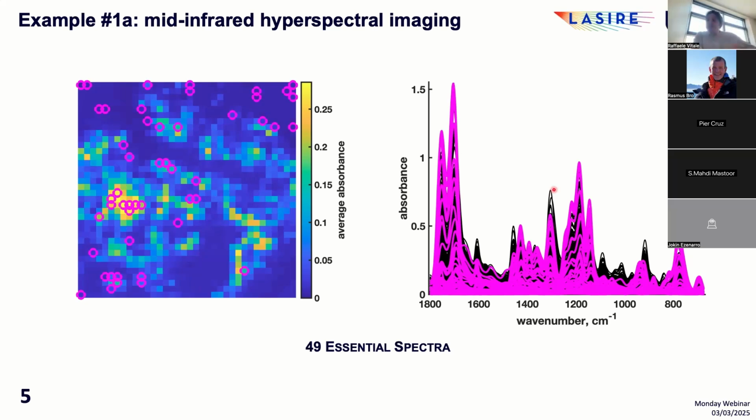Therefore, all that we detailed previously remains valid, with the only difference that the aforementioned abundance or concentration profiles become here spatial maps, highlighting how the individual components are distributed over the investigated samples. This being said, in order to compare the spectral unmixing carried out only on the ensemble of selected essential spectra and on the entire dataset under study, we applied to both of them one of the workhorse chemometric algorithms conceived with this purpose, multivariate curve resolution alternating least squares, also known as MCR-ALS.